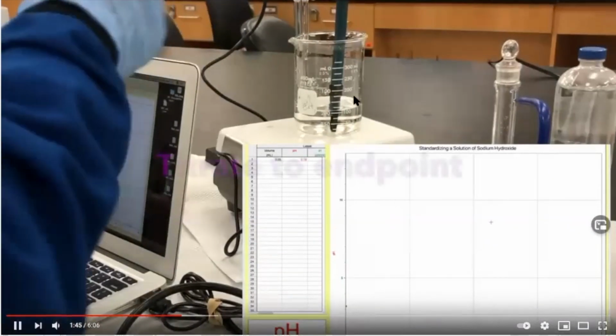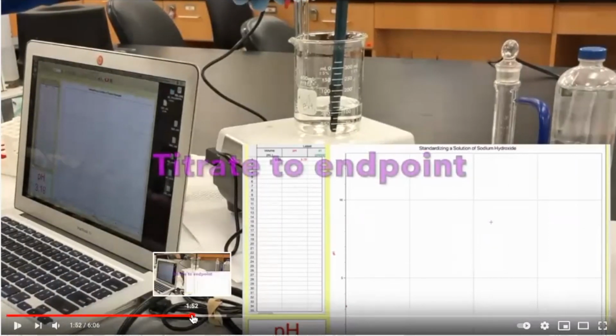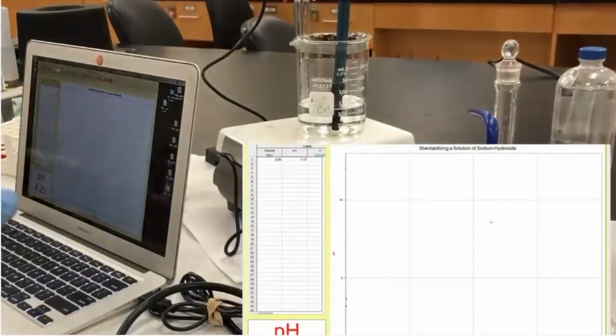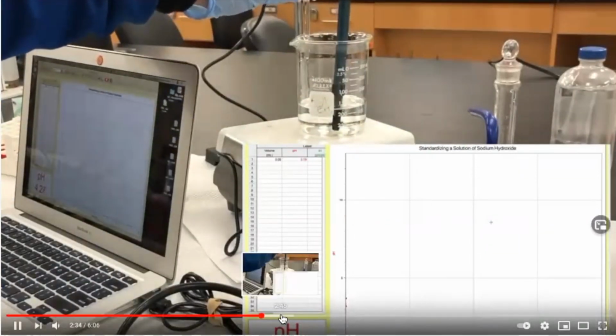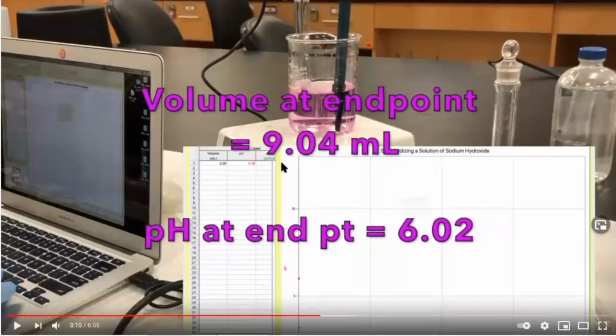And notice I got both a pH probe and an indicator here, but what I'm going to do is stop at the equivalence point. I went ahead and titrated this, and I stop right here. See how it turns pink? First sign of pink, permanent pink, I stop. The pH at the endpoint is 6.02. That's not what I'm using, but the equivalence volume is what I need.